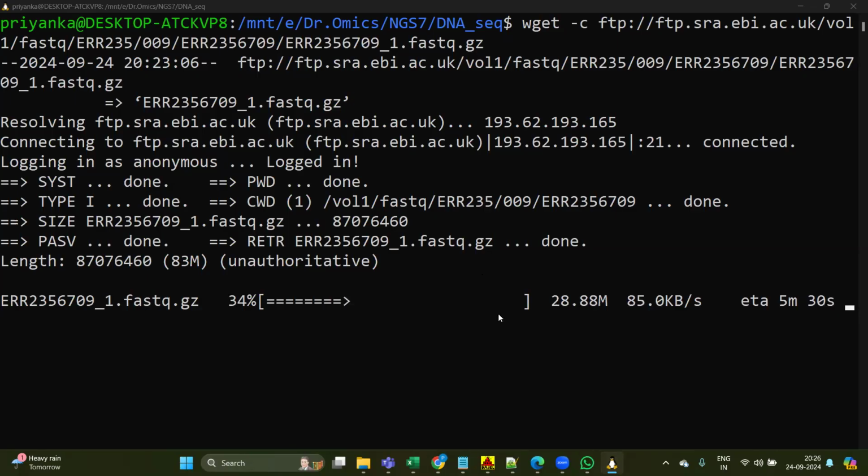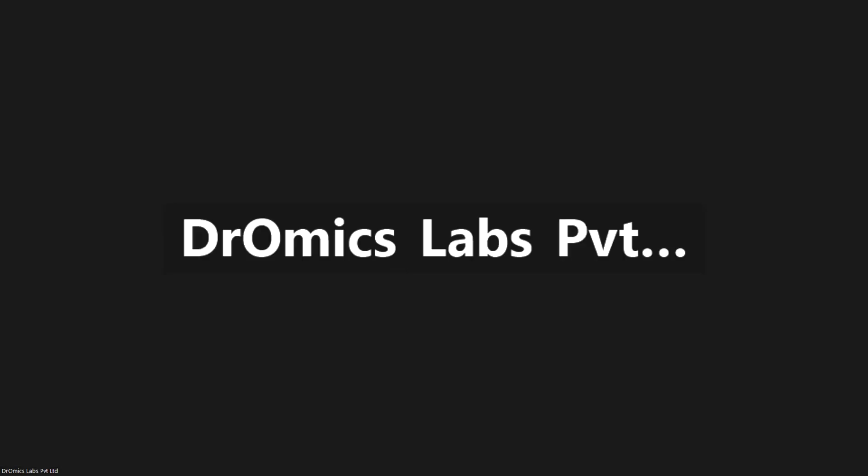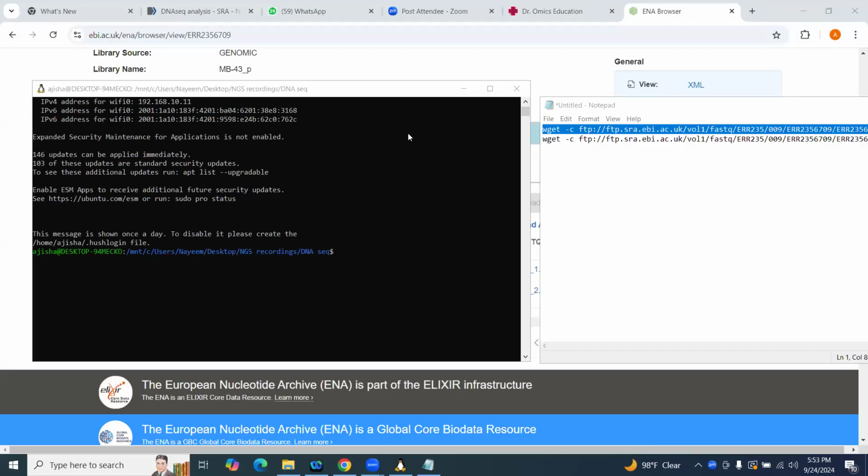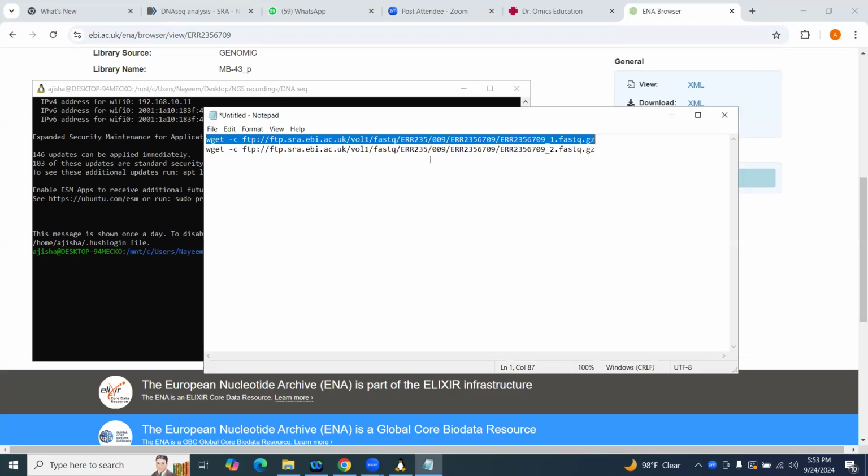If you are still facing the issue, you can start your screen share so that I'll try to handle your system. Yeah. Okay. I'll share the screen. Okay, in the notepad, use Control C to copy that command.